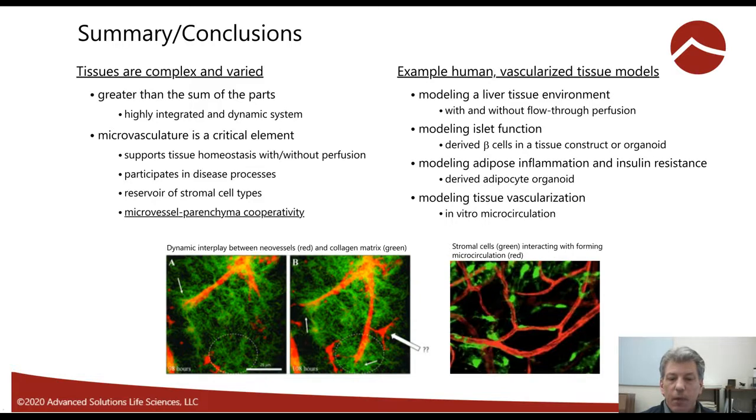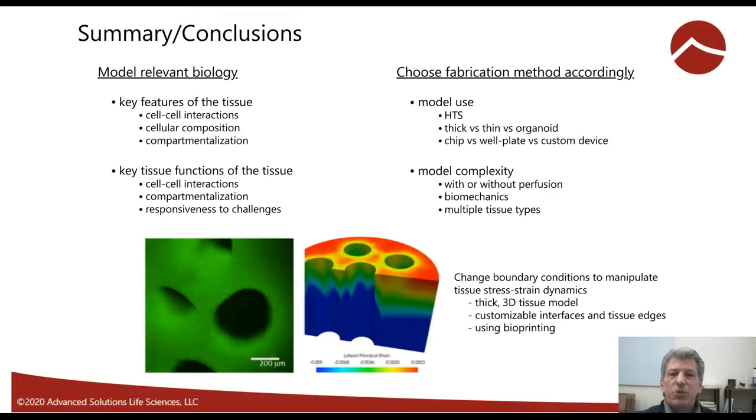as well as physiologies. And with respect to strategies that we take to build these models, we don't always necessarily try to recapitulate a complete tissue, but those aspects of the tissue that we're most interested in. So perhaps it's cell-cell interaction, maybe it's dermal, subdermal dynamics that we want to see in the skin, or cellular composition. Experimentally we want to reconstitute in different ratios or different cellular elements to understand the biology.